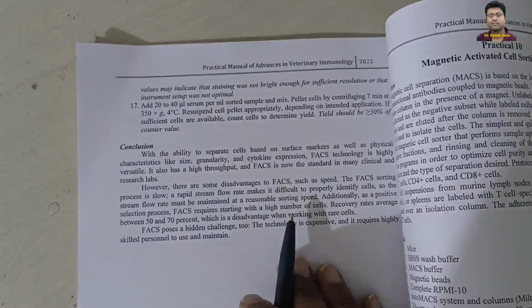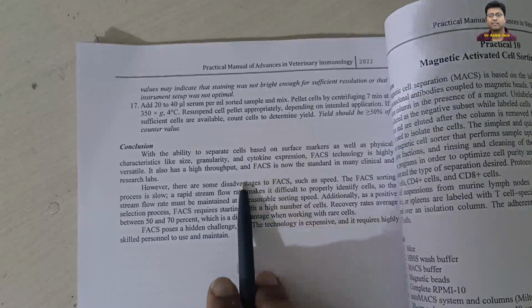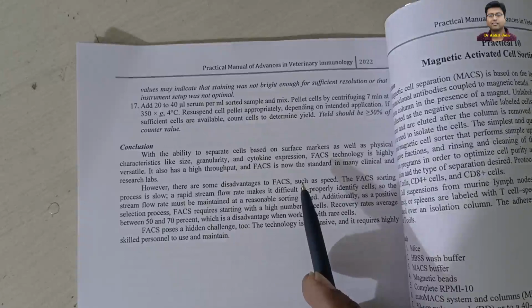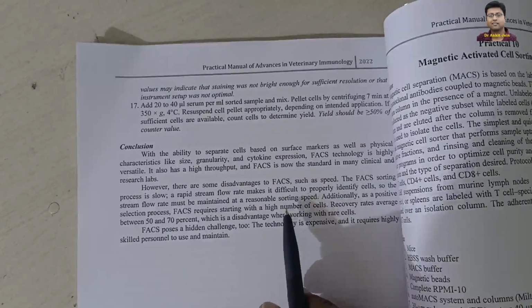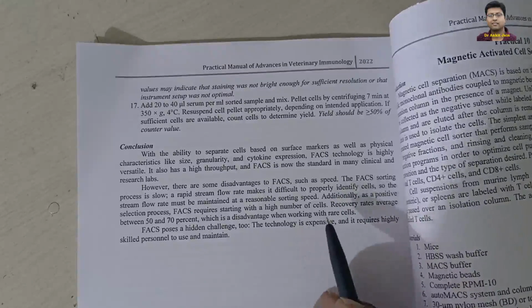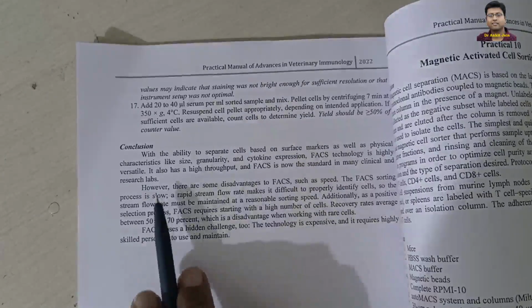Now finally, conclusion क्या है? Actually, the FACS is a very versatile technique because it is used for the study of oncology, for the study of stem cell, for the study of hematology and hematopoietic analysis, and for the different stages of cells with the help of their presentation of marker, their expression of marker. So now it is very popular and it is now used in different clinical and research labs.